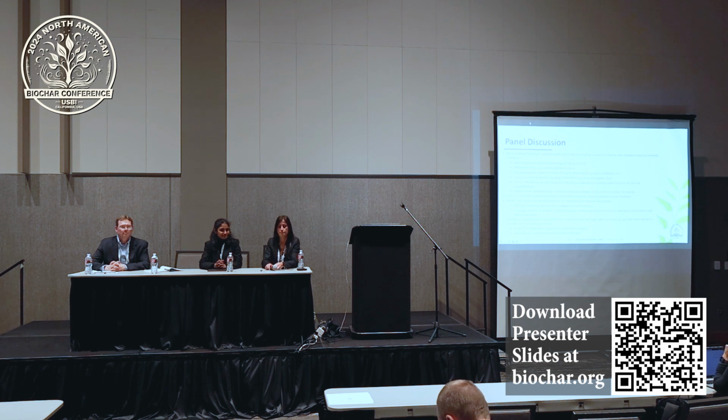Thanks. My question's somewhat open-ended, but the certification requirements from EBC and IBI, we've seen them change over the years. Some things like germination inhibition, you've seen that drop off the list of requirements. My question is, as you're looking forward, do you see the list of analyses that are required for certification dwindling? And if so, are there any tests that you would like to see also fall by the wayside? Thanks. Thank you.